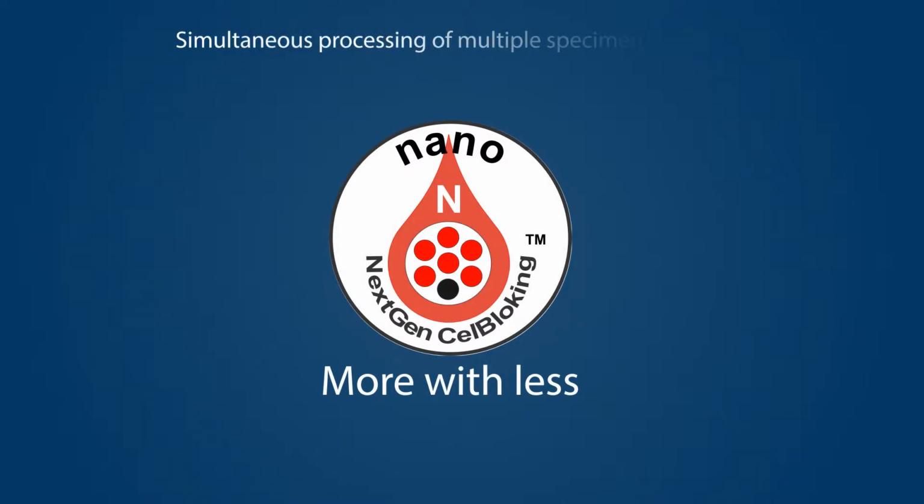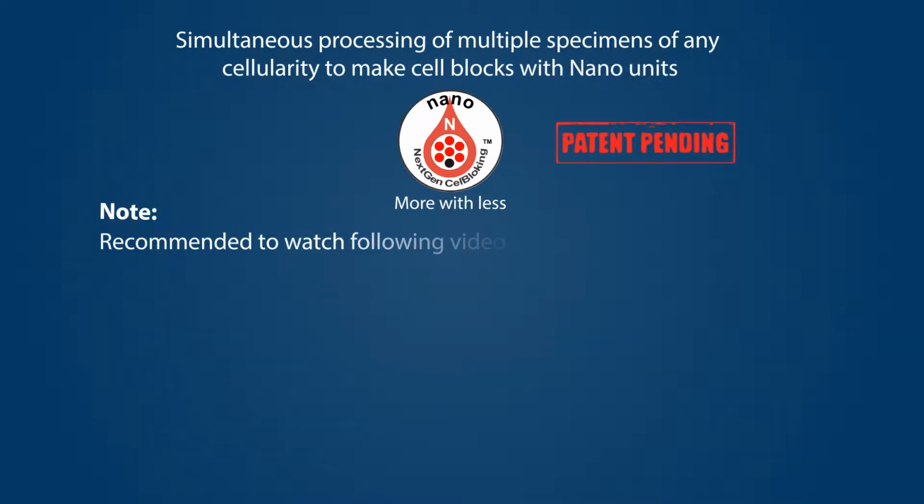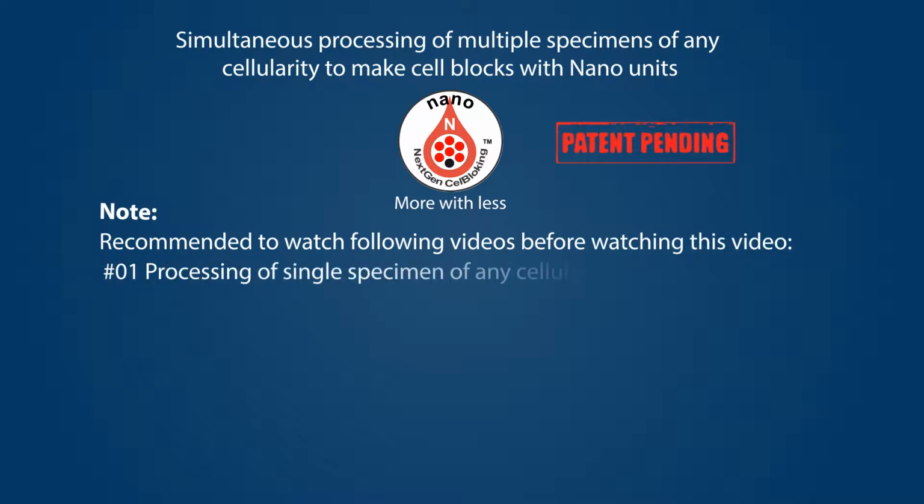Simultaneous processing of multiple specimens of any cellularity, to make cell blocks with nano units. Notes: recommended to watch the following videos before watching this video. Processing of a single specimen of any cellularity, to make a cell block with a nano unit.